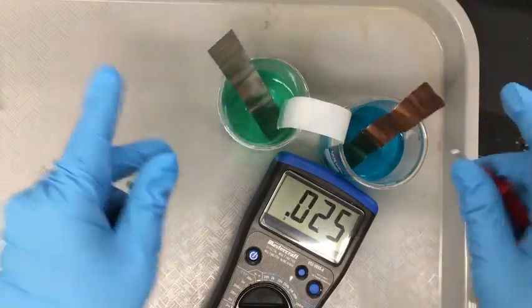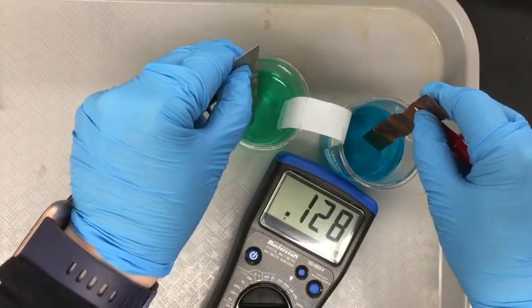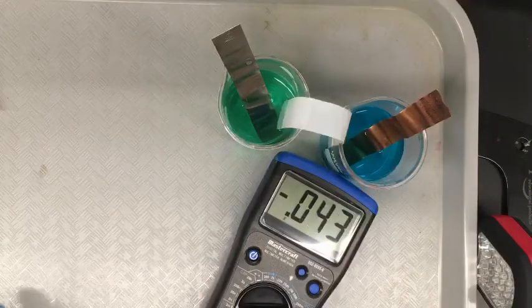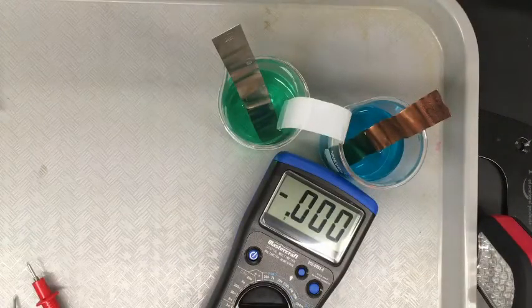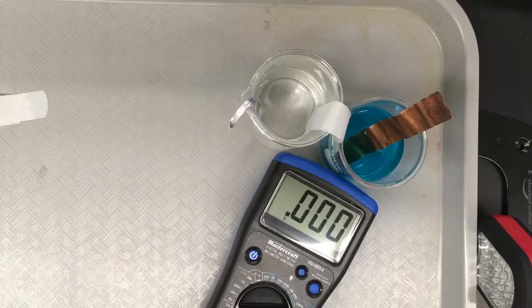Here, I'll do a rereading. So about 0.13, we'll say. That seems to be where it's dancing around. So when we have nickel with copper, we get 0.13 volts.